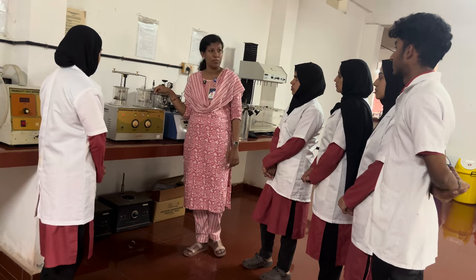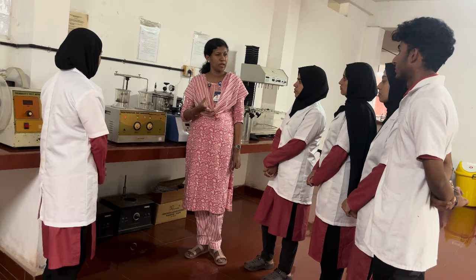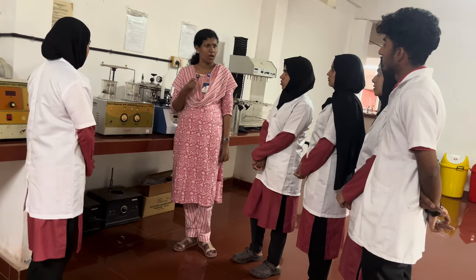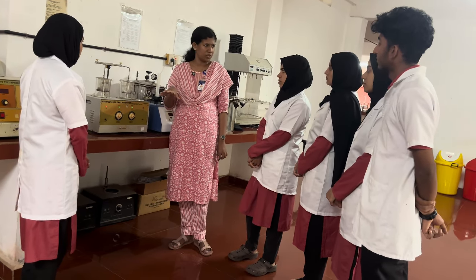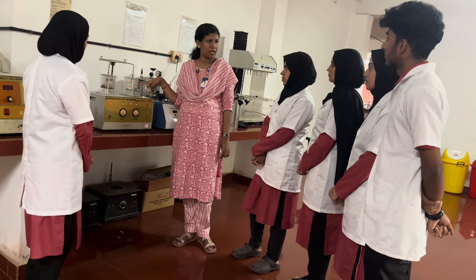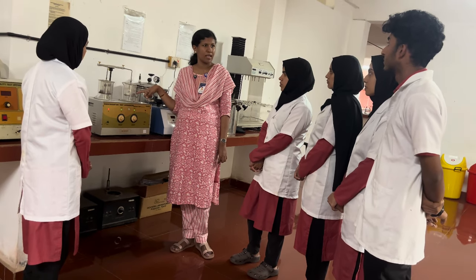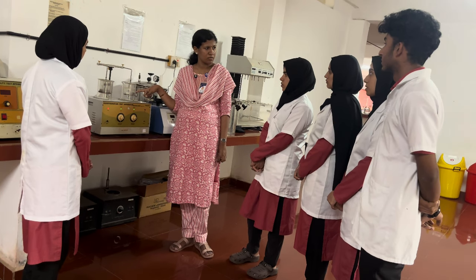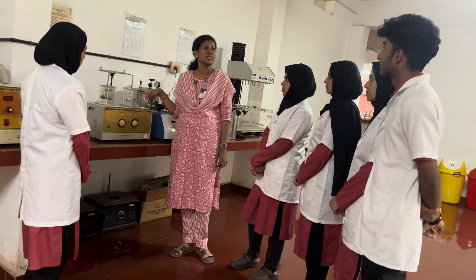Then what about film coated and enteric coated tablets? What do you mean by enteric coated tablets? It should disintegrate in the intestine. It is unaffected by the gastric pH. For paracetamol, the medium we are taking is purified water. For another one, we are taking simulated gastric fluid. For an enteric coated tablet, what do we have to take? Intestinal fluid having intestinal pH, simulated intestinal fluid.